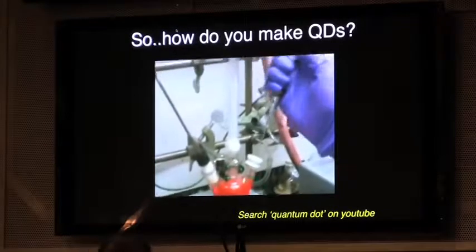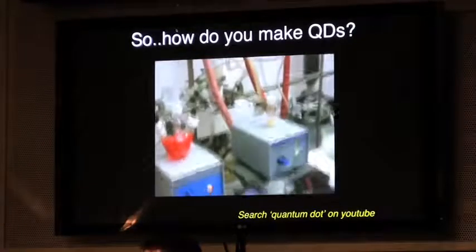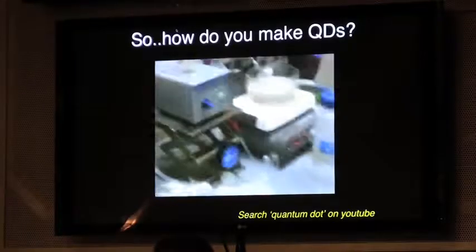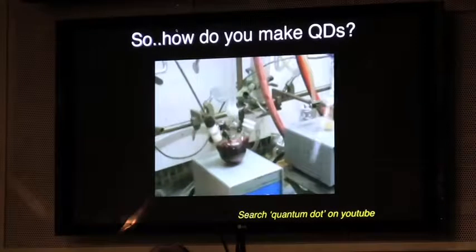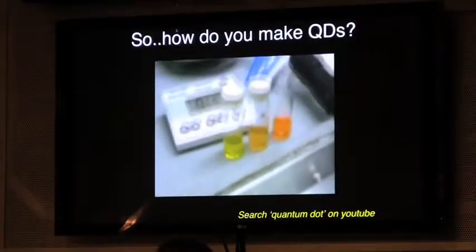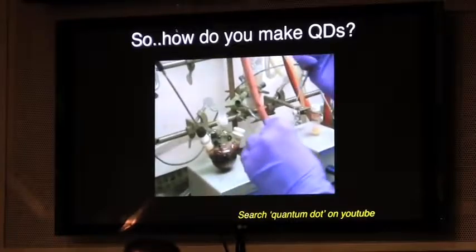And what's happening here is, as the reaction goes in time, we see something very interesting. We see the actual color of these nanocrystals, or these quantum dots, changing. And I think it gets to it right now. You can actually see the color of these crystals changing as they grow in size.